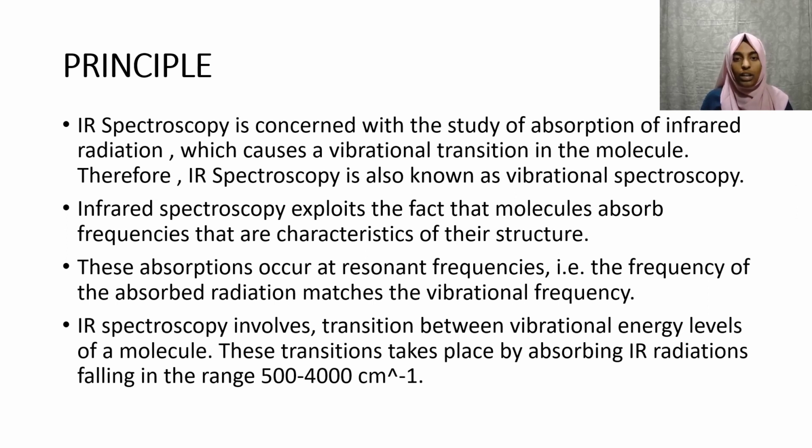These absorptions occur at resonant frequencies, meaning the frequency of absorbed radiation matches the vibrational frequency. IR spectroscopy involves transitions between vibrational energy levels of a molecule. These transitions take place by absorbing IR radiation falling in the region 500 to 4000 centimeter inverse.